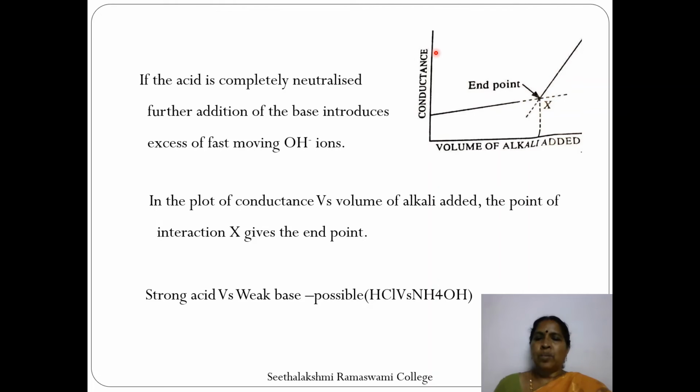On adding ammonium hydroxide, a decrease in conductance will be observed. After the endpoint, a slight increase or constancy in conductance is observed, because ammonium hydroxide is a feebly dissociated weak base.